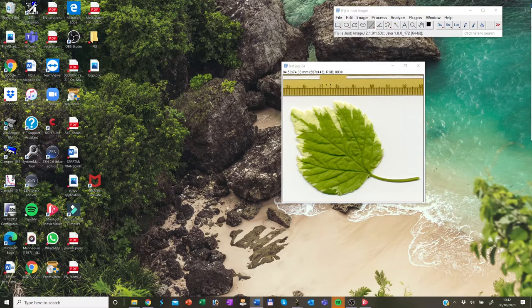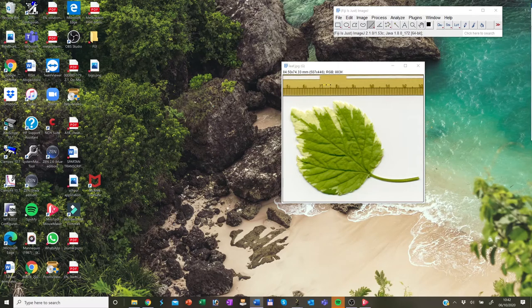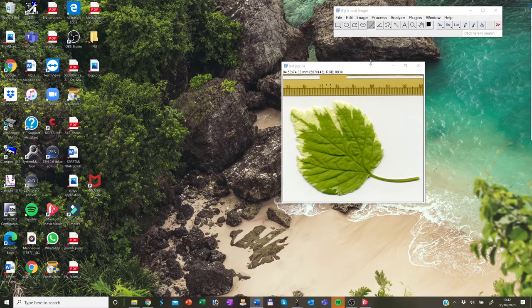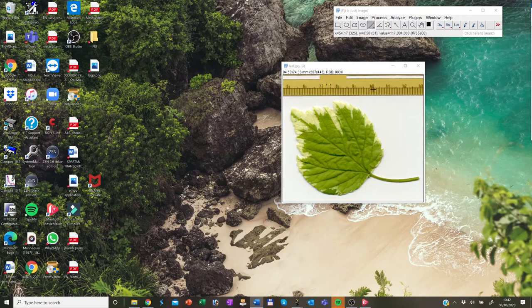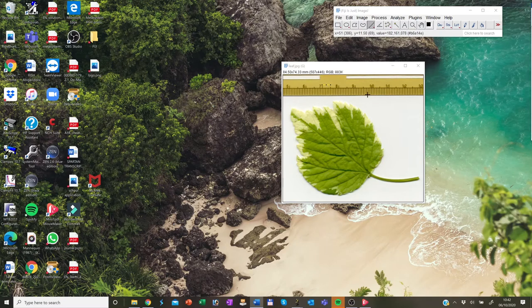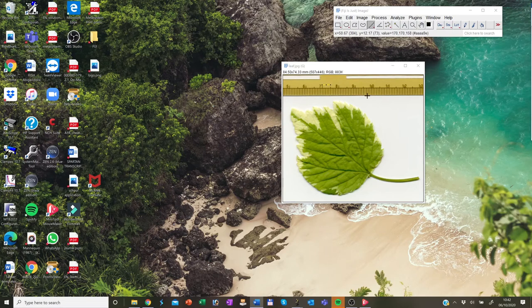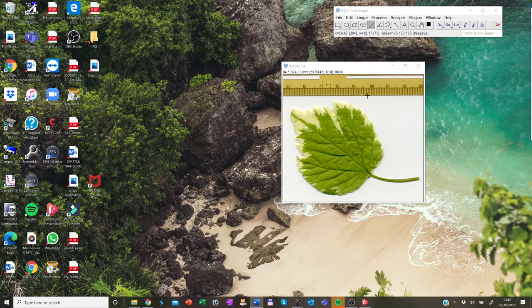Note that for the micrometers, you can either type UM or micron. Now this work that I just showed you is only required if the images aren't pre-calibrated by the acquisition software. If they are, you can just start from this point and you add the scale bar to your data.